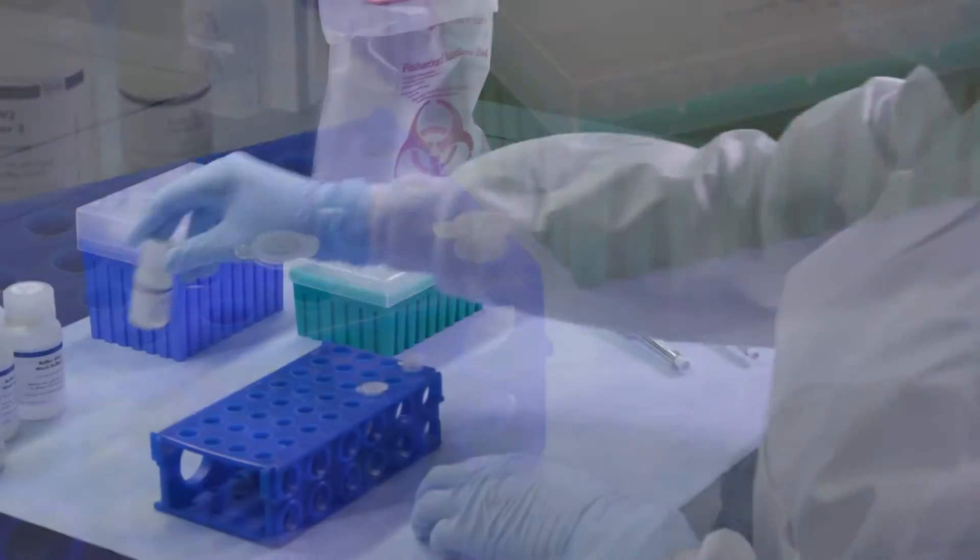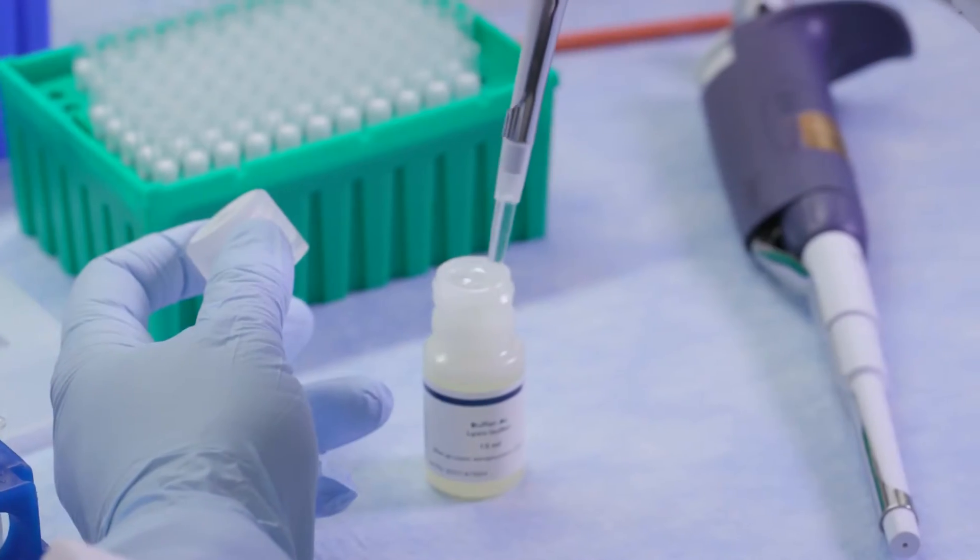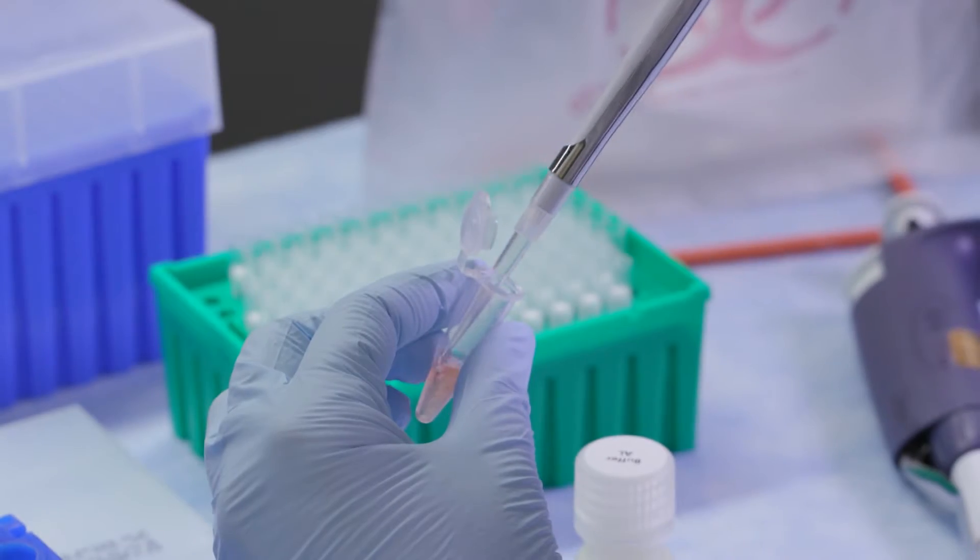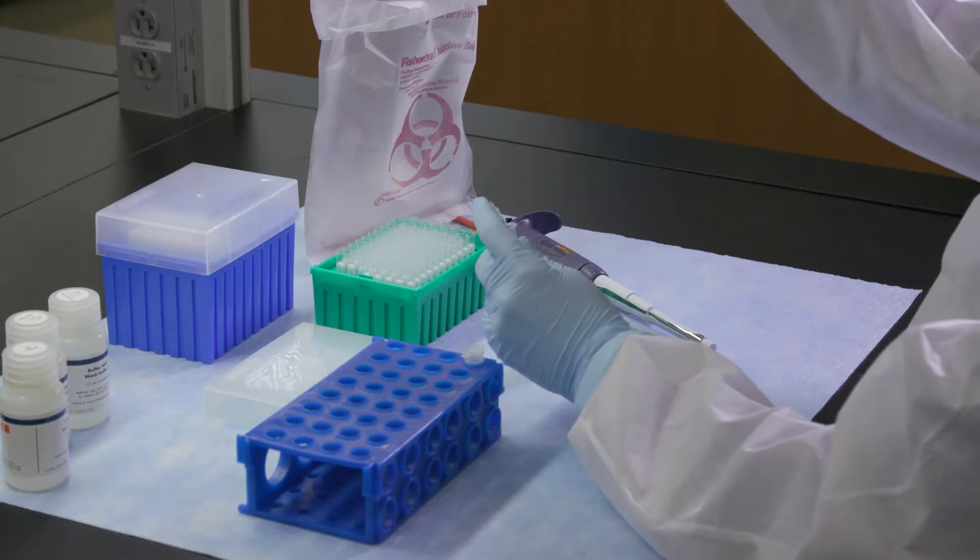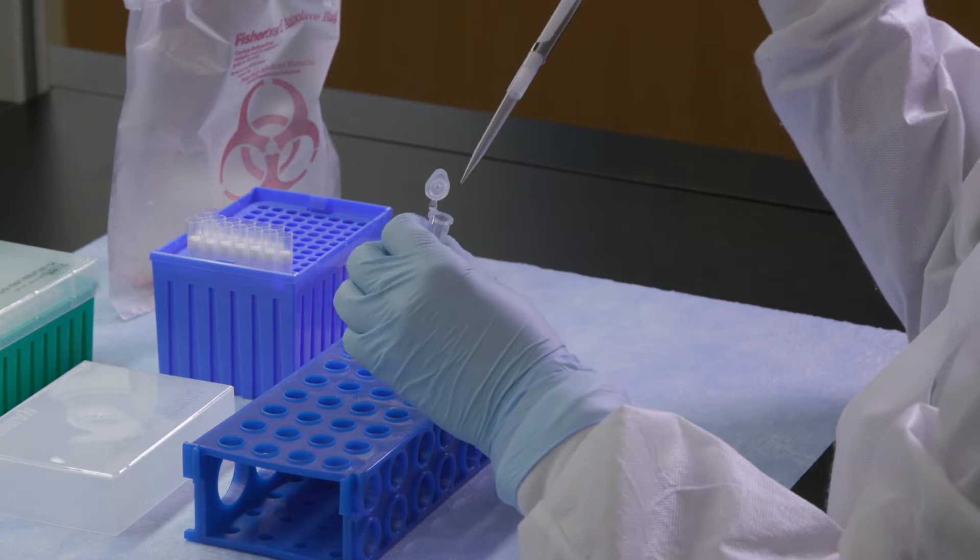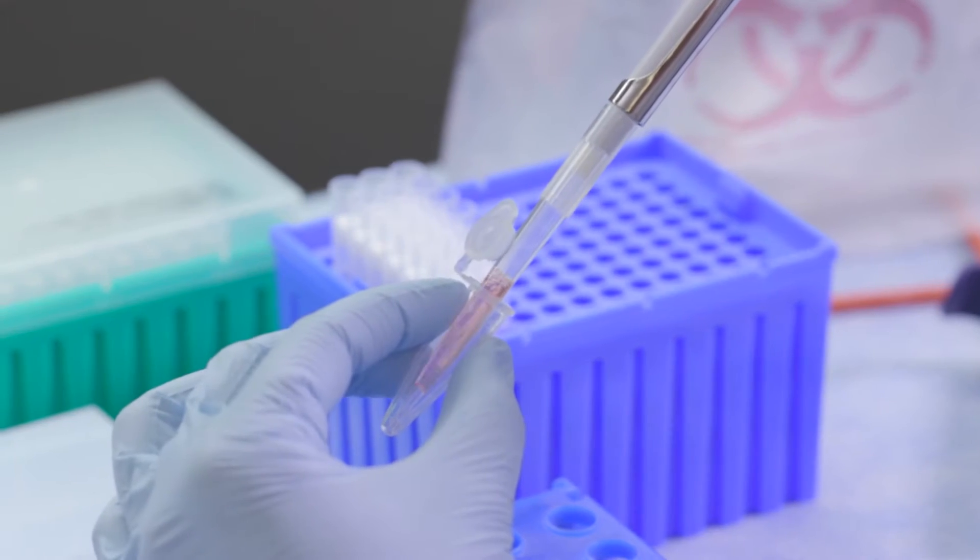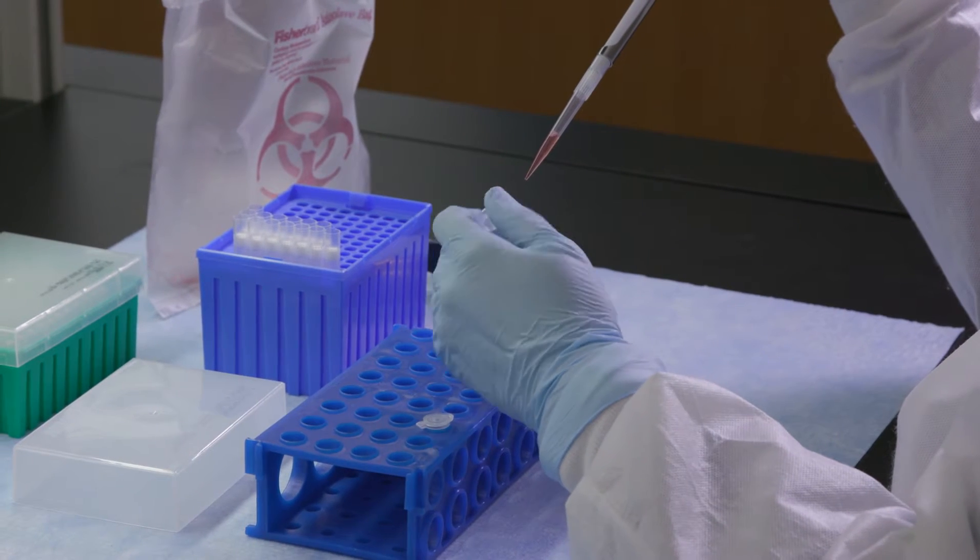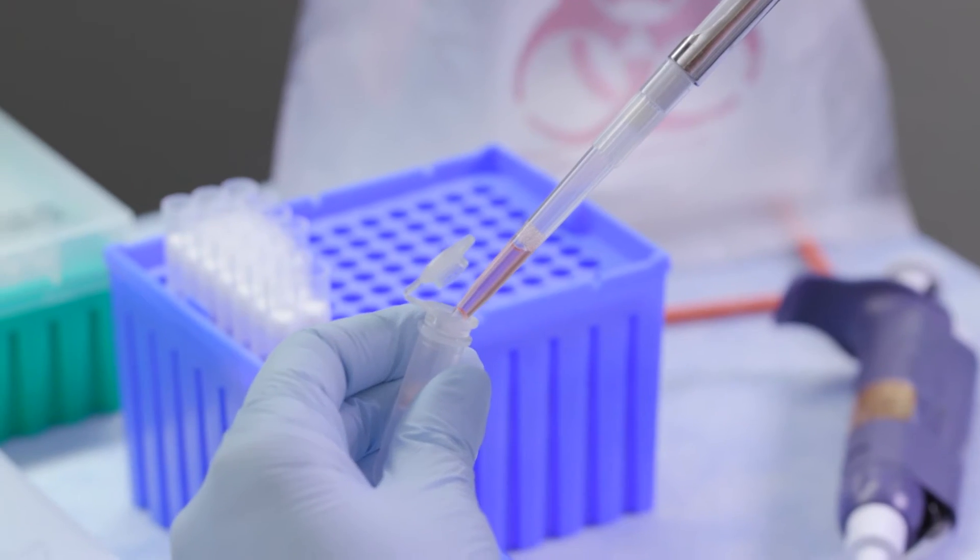After lysis, apply cell lysate to a column in the presence of a high salt buffer allowing nucleic acid and nucleic acid binding proteins to absorb to the matrix. Other cellular components and proteins do not bind to the matrix and pass through the column as the lysate is applied.